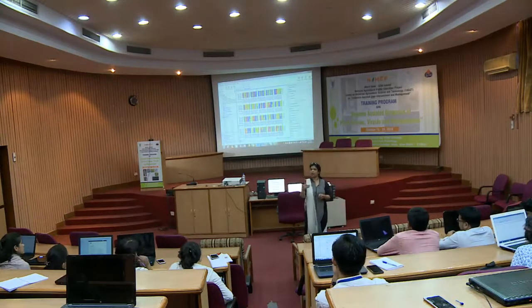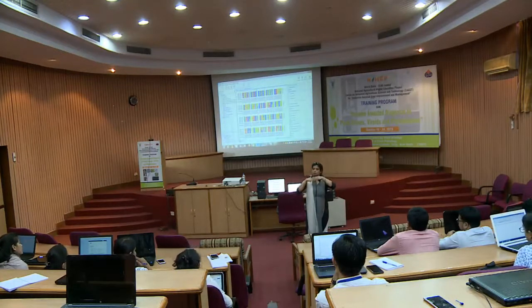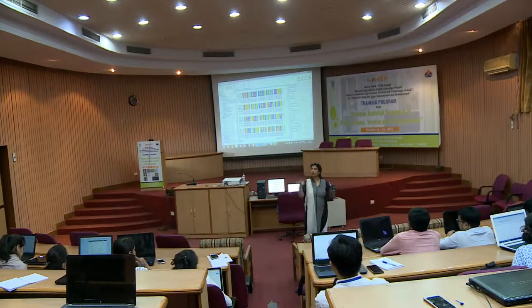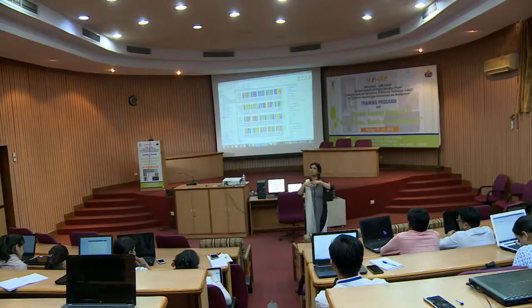Okay. Now this is the region, right? Now my fingers are on the consensus, but the whole sequence is the Contig. From here to here it is Contig, and this is consensus. Consensus is actually the conserved part, similar among all, right? But Contig is where you are joining the two sequences considering the overlapping region as a single one.